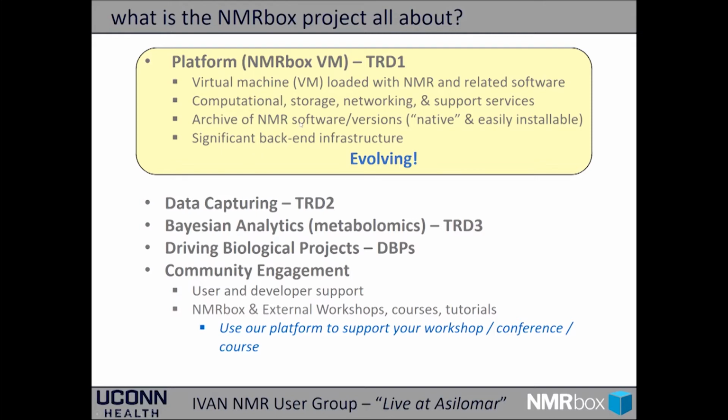It's also about archiving the software into versions, so we'll always be able to run older versions of software. And there's obviously significant backend infrastructure. And I put evolving because the NMRbox platform is continuing to evolve. As technology changes, as the needs of the community change, we're constantly evolving our platform.